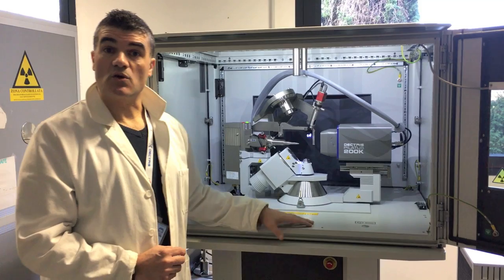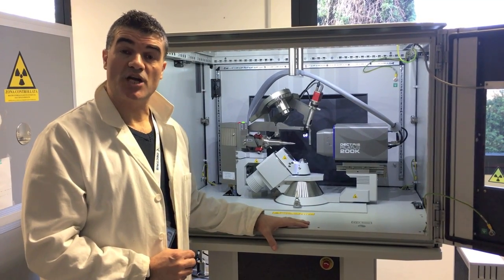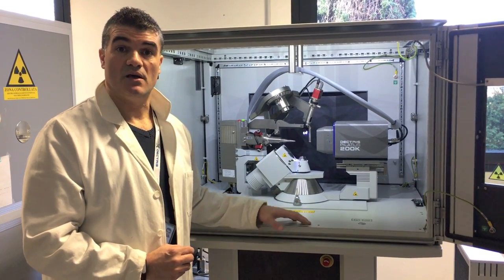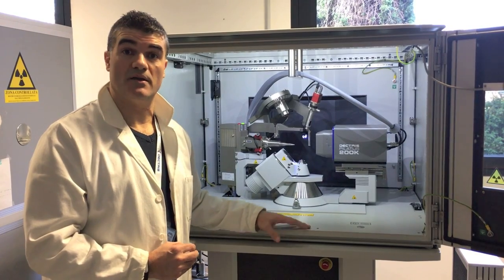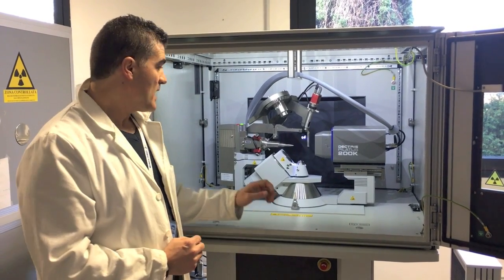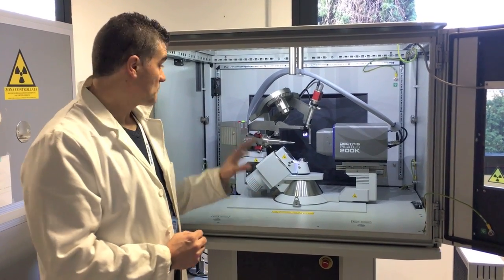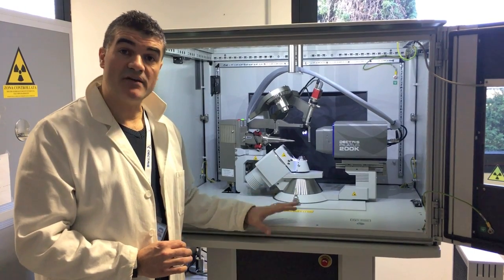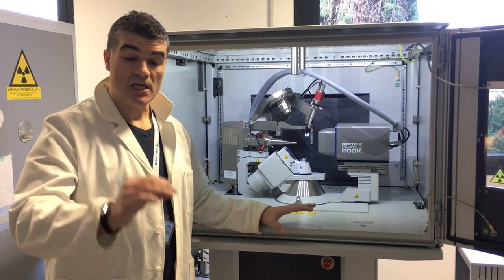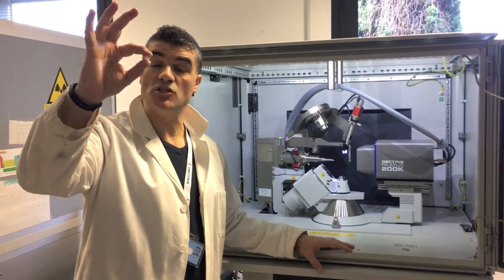This instrument was acquired thanks to the European Research Council, which funded me a five-year research project with 1.4 million euros. And it is specially designed to study very tiny mineral inclusions in large diamonds, like this one, which is a 7-carat diamond.